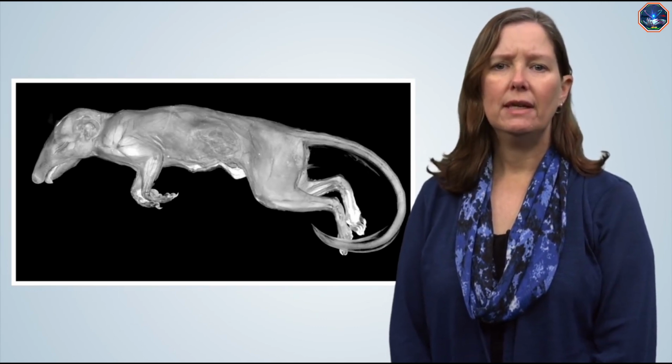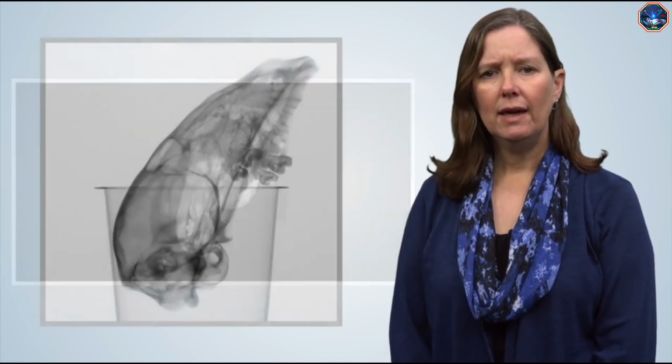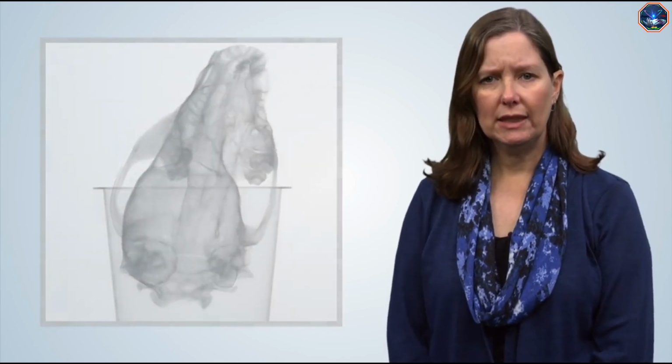Because of the non-destructive nature of the micro-CT and its ability to visualize structures that are otherwise difficult or impossible to see, it has become a popular tool in many fields of research. You've already seen some examples of a USB and its internal circuitry being examined, of animal muscles and skeletons being scanned, and of fossils being digitized.